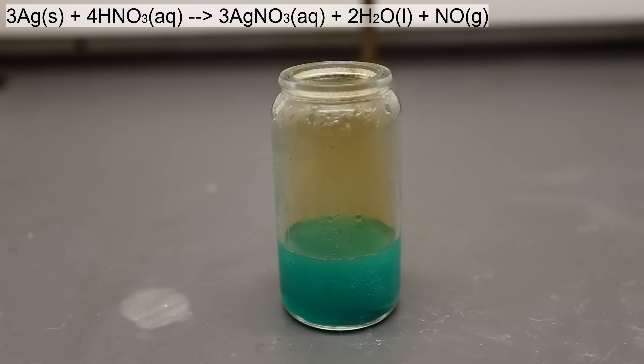For this reason, it's extremely important that you carry out this reaction in a fume hood or a well-ventilated area. The color change is not due to the reaction of silver with the nitric acid — it's actually due to the reaction of copper with the nitric acid.